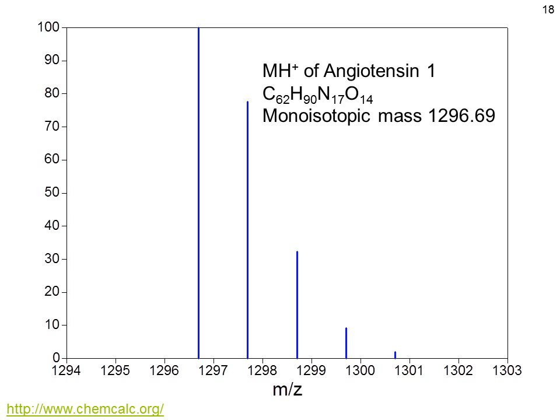The main peaks that we see for this molecule, and this spectrum is all just this one molecule, the MH plus ion, are a peak at 100% on the left, then spaced by 1 atomic mass unit to the right, the first peak with 1 carbon-13, the next one with 2 carbon-13s, 3 carbon-13s and 4 carbon-13s.